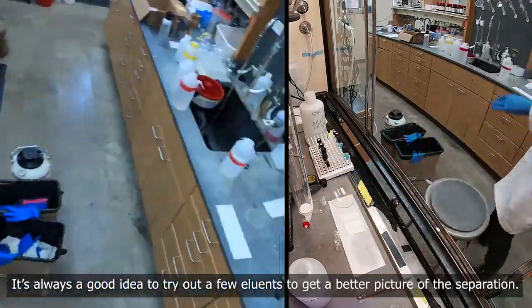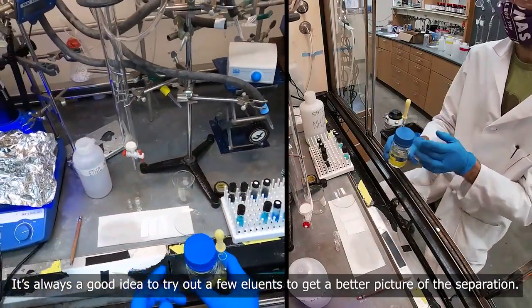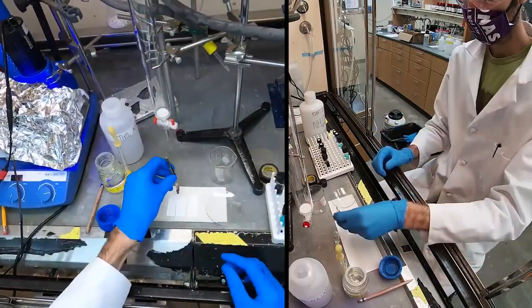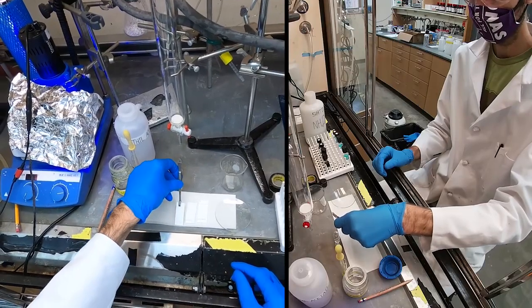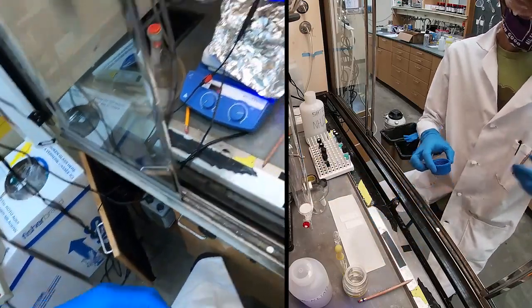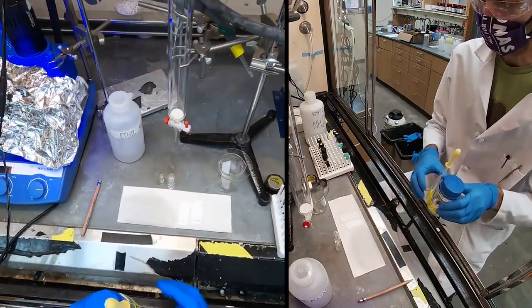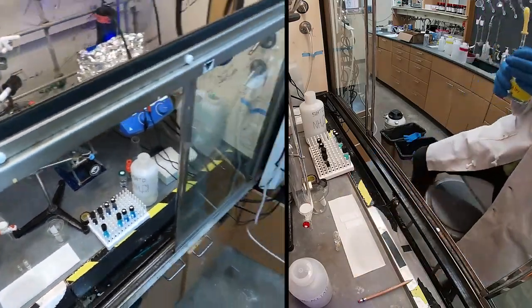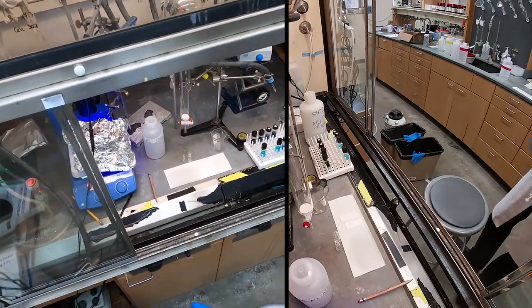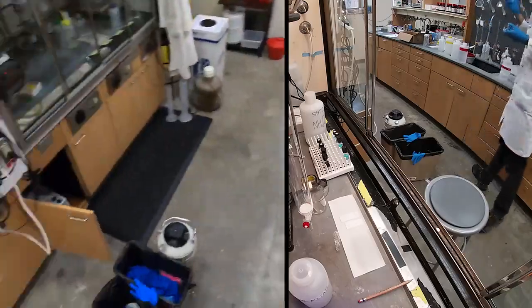So I might just give 40/60 a quick check to see if the separation is any better there, because that separation is not ideal. I could have some mixed fractions at the tail end of my product band, because that difference in Rf there is not huge. So sometimes if you use a more polar eluent, you can exaggerate the separation that you have. So we'll do that, and I might check 20% too at the same time, just while I'm here.